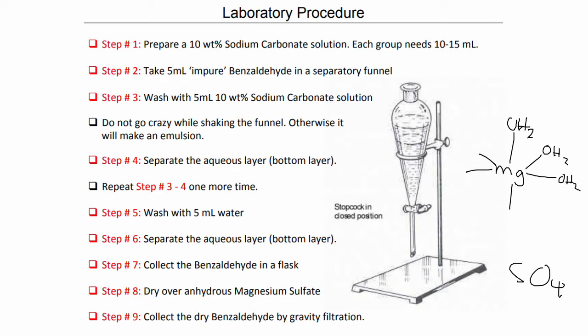So this removes all of the water from our organic benzaldehyde. And once we've dried it, we just filter it through a filter paper and collect our benzaldehyde.